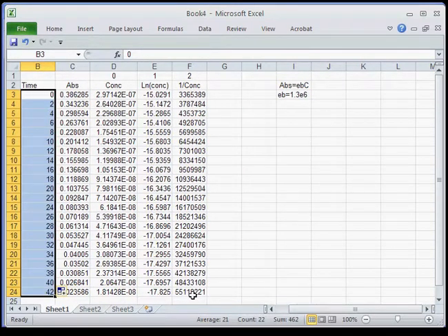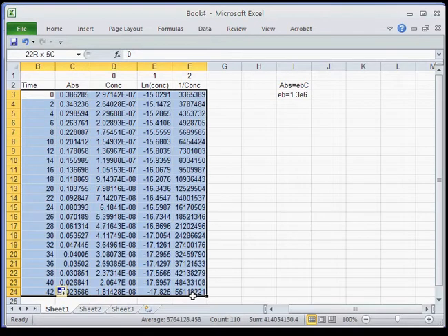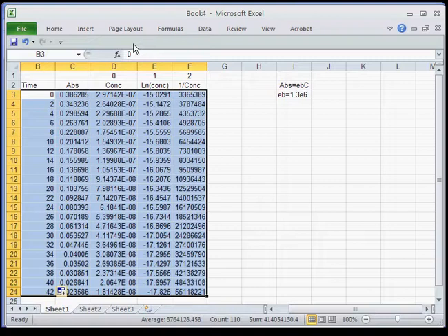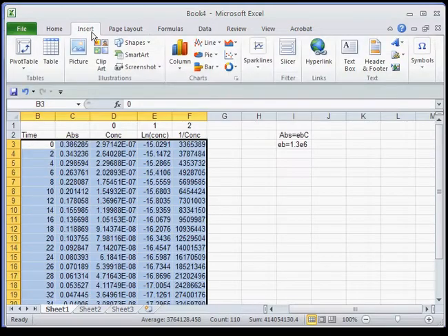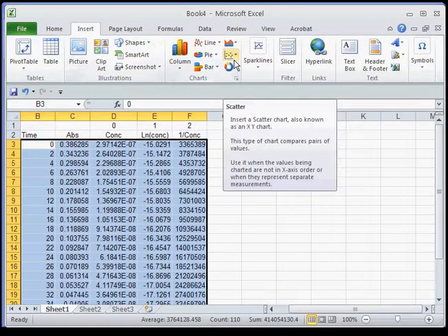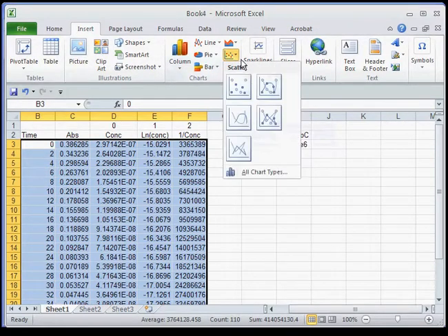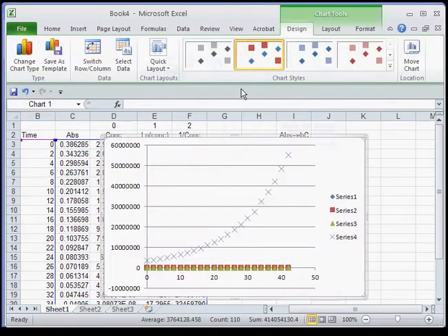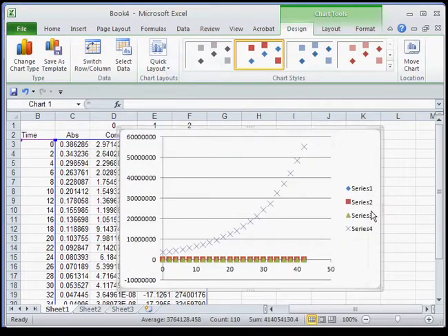Finally, I need to make a graph. The easiest way is to highlight all the data, go to Insert, and do a scatter plot. You'll notice there are several data series — series 1, 2, 3, and 4 — corresponding to the four columns.